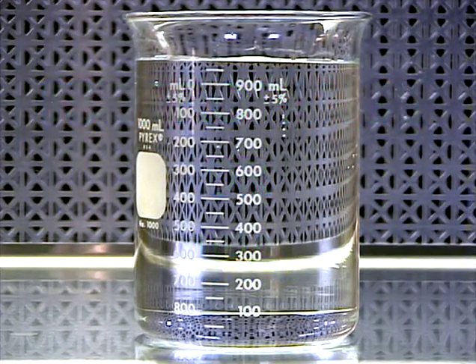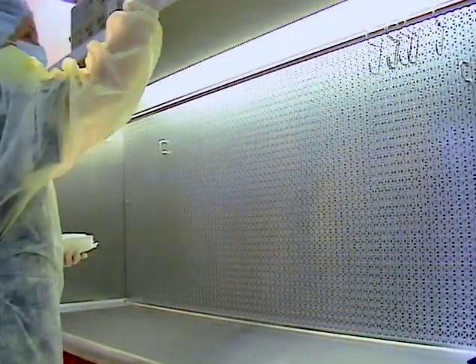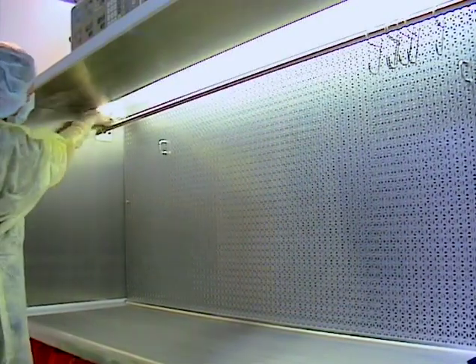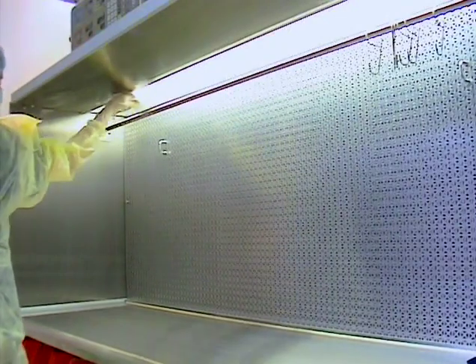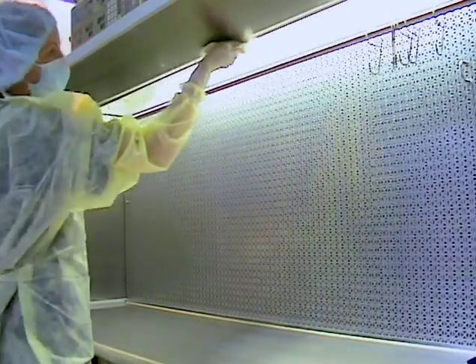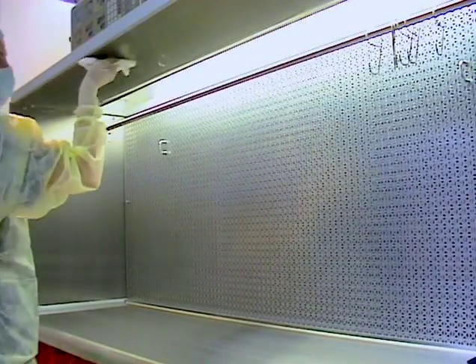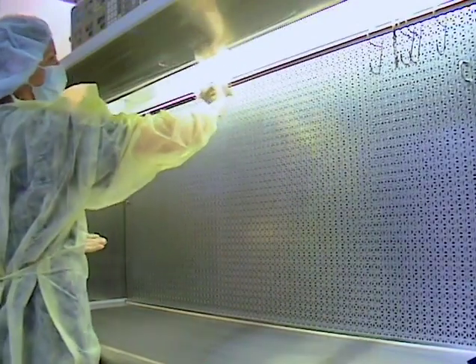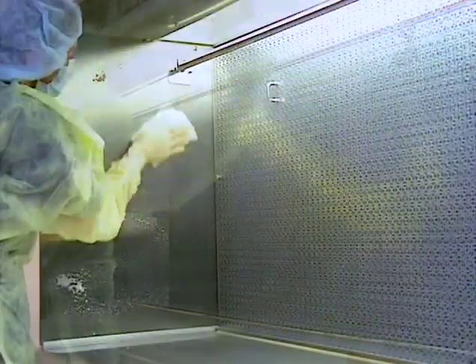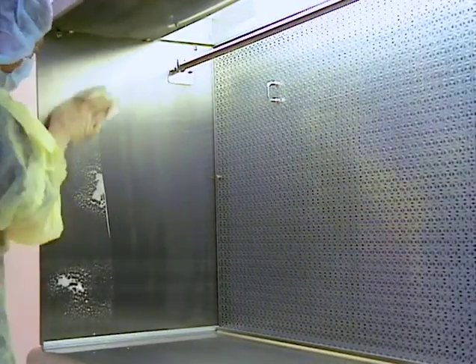The proper method of cleaning a horizontal LFCB should begin at the top inner surface, which usually contains the lighting panel, to prevent cleaning solutions from dripping onto previously cleaned surfaces. Using care not to touch the HEPA filter, begin at the rear of the hood, using strokes parallel to the HEPA filter and gradually work your way to the front of the unit. Next, clean the IV pole and hooks. The sides of the clean bench should be cleaned with vertical, top-to-bottom strokes, again working your way from the rear to the front of the unit.